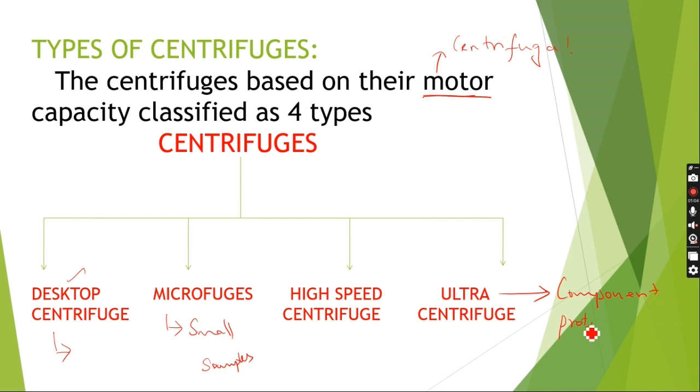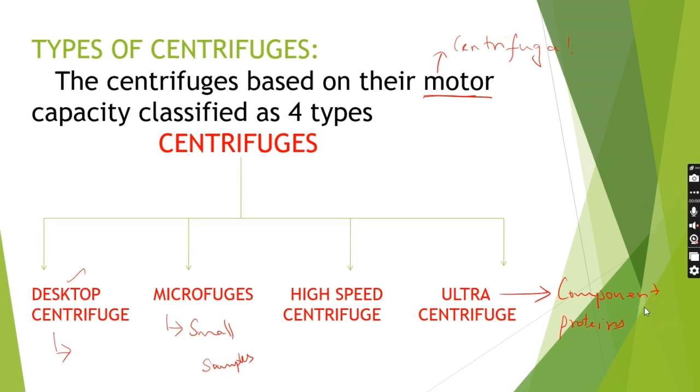particularly proteins, which can be easily sedimented. Different proteins that have only a small difference in molecular weight can also be sedimented by these ultra centrifuges. Now we can look at the centrifuges individually.